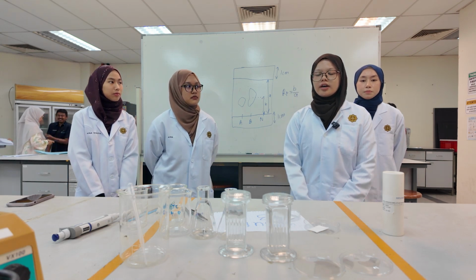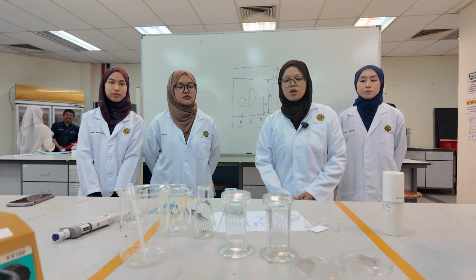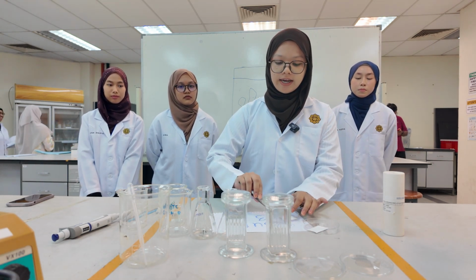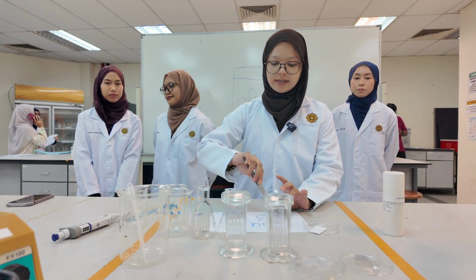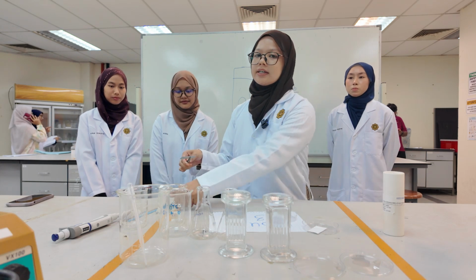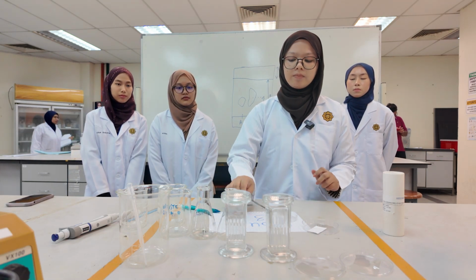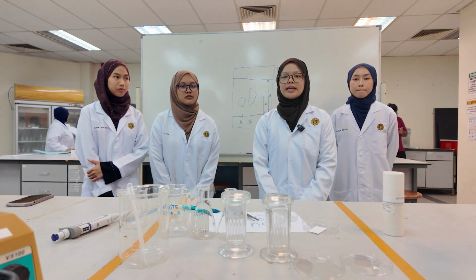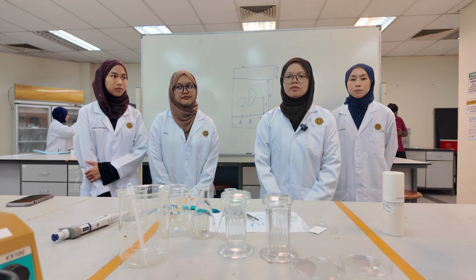Next precaution of the TLC experiment is when we draw a line on the TLC plates, we need to make sure that we use pencils instead of pen. This is because pencils are made from graphite, which is insoluble in the solvent, so it cannot interfere with the result.